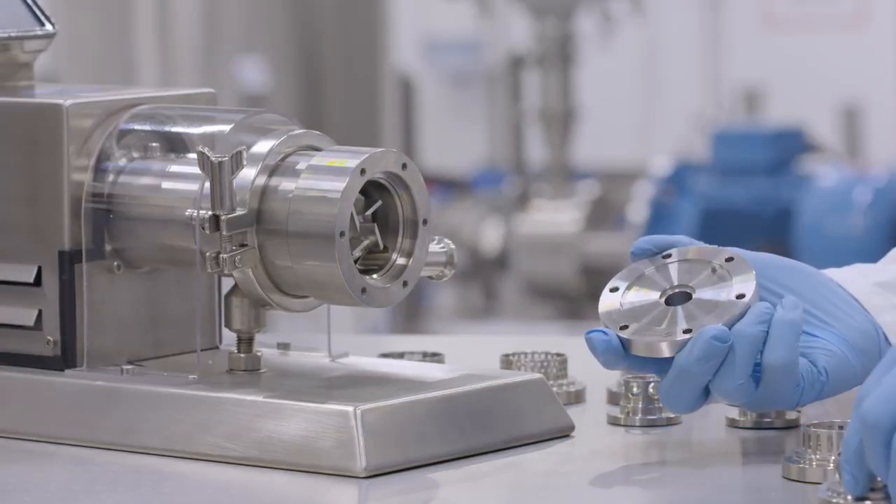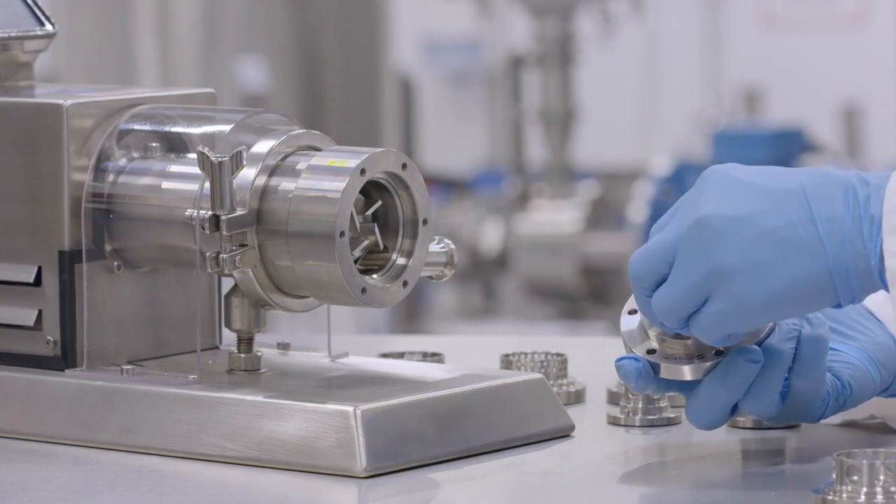Self-pumping and aeration-free, the Verso is equipped with a range of interchangeable workheads.